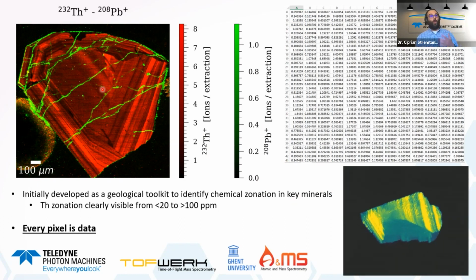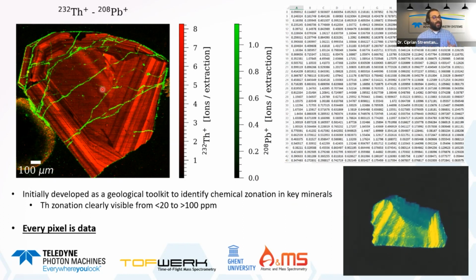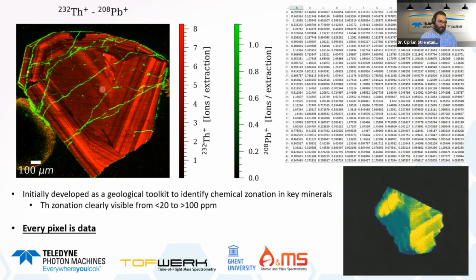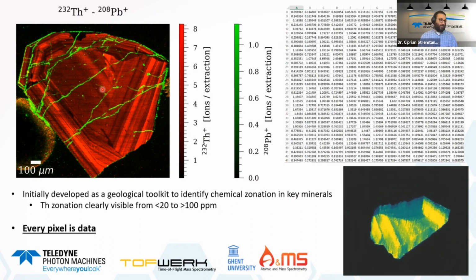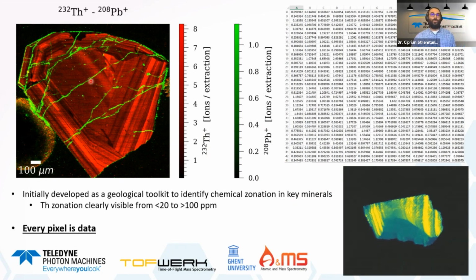And this can also be captured by using laser ablation ICP-MS, and that's what the video is showing. Basically, it's showing the distribution of uranium in a zircon grain as a function of depth as well.